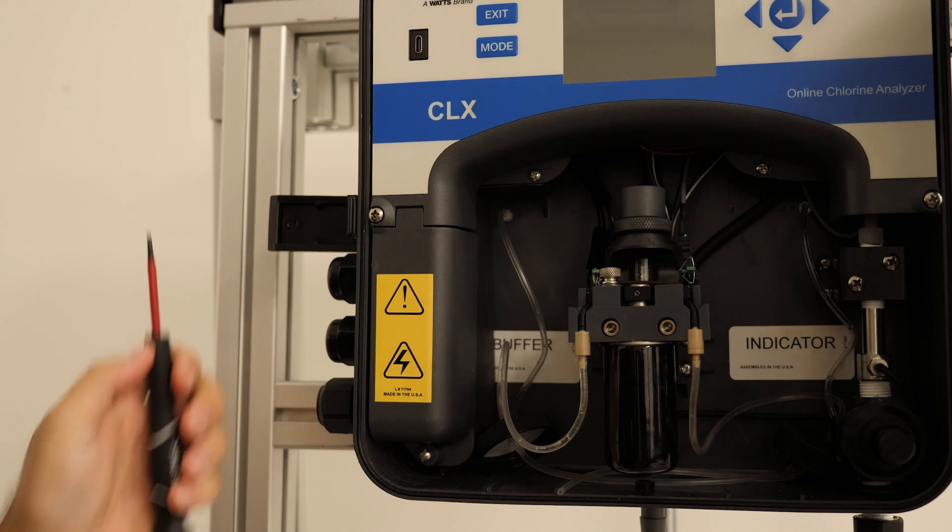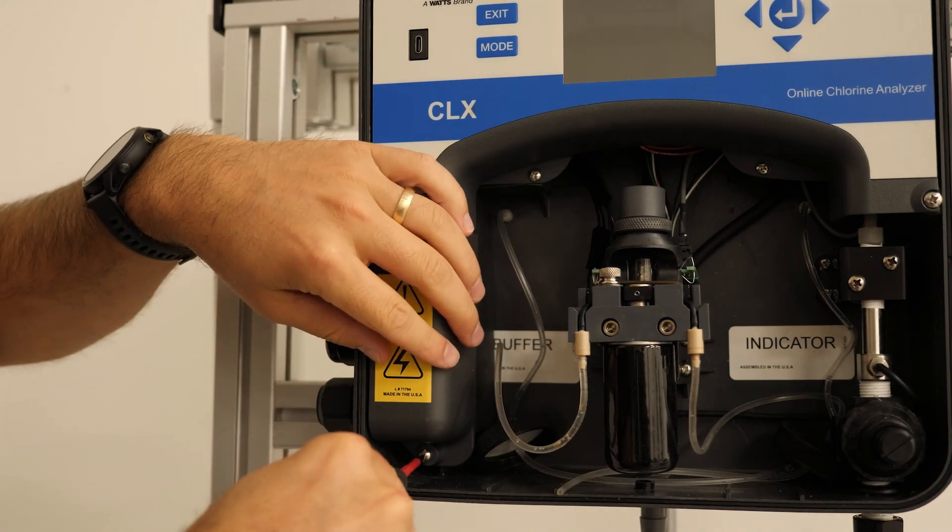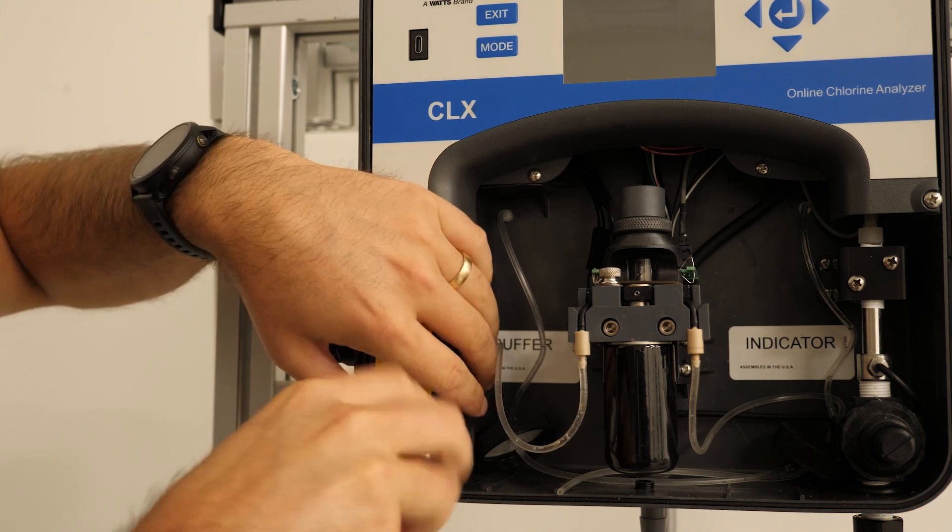Next, we will wire the power side of the analyzer. We will start by removing the plastic cover and finding the green power connection.